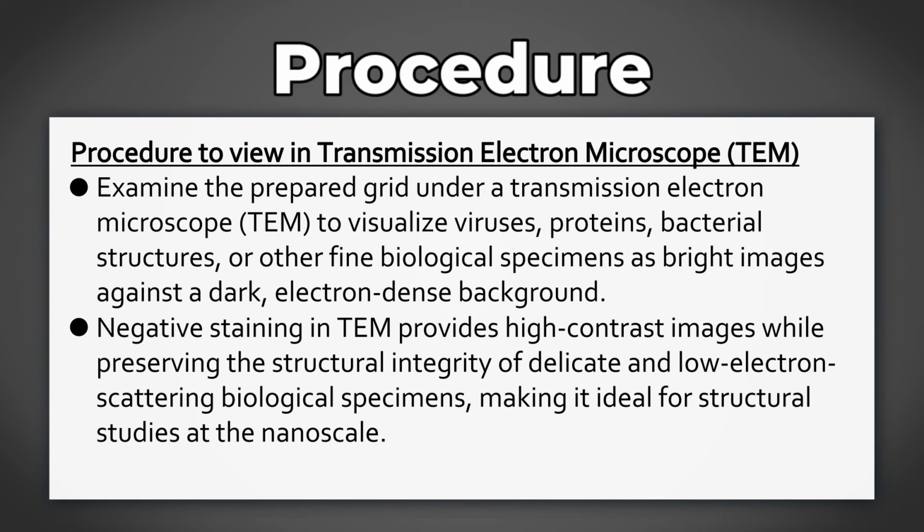Negative staining in transmission electron microscope provides high-contrast images while preserving the structural integrity of delicate and low-electron-scattering biological specimens, making it ideal for structural studies at the nanoscale.